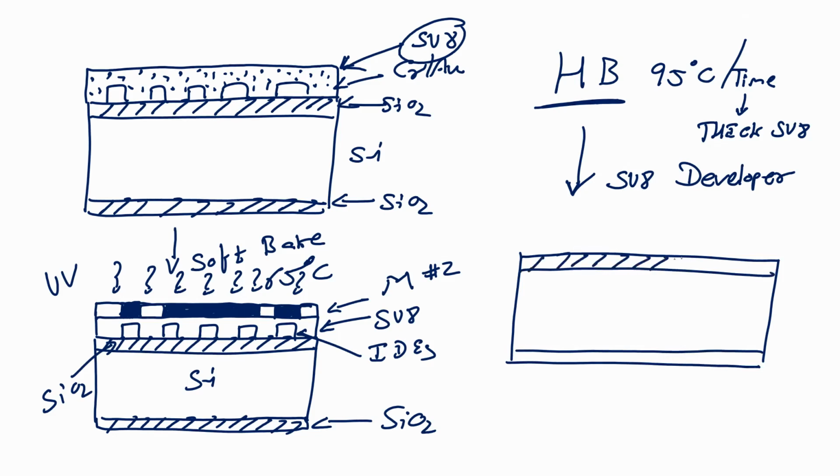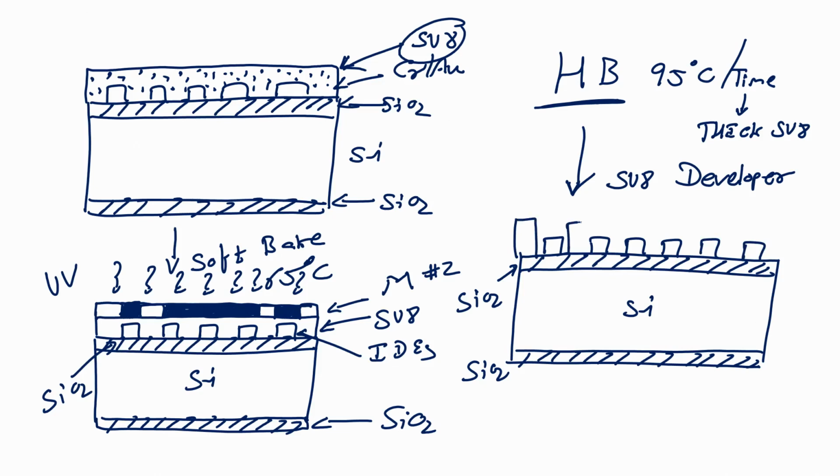I will have an oxidized silicon substrate with interdigital electrodes and an SU8 well, right.